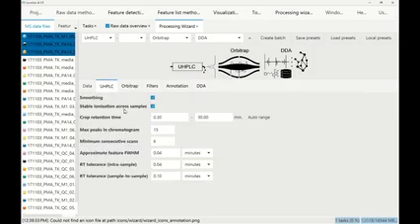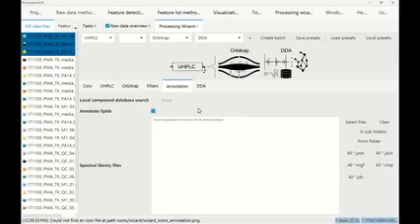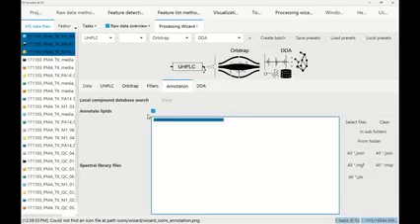Yeah. So they might be a little bit different from the preset, but it's totally fine to use the presets for now. So typically you would want to, of course, optimize depending on your peak width. You would optimize the parameters, but that we can see afterwards how you would actually do this. So I don't want you to put in too many numbers here. And so the presets work for this data set.